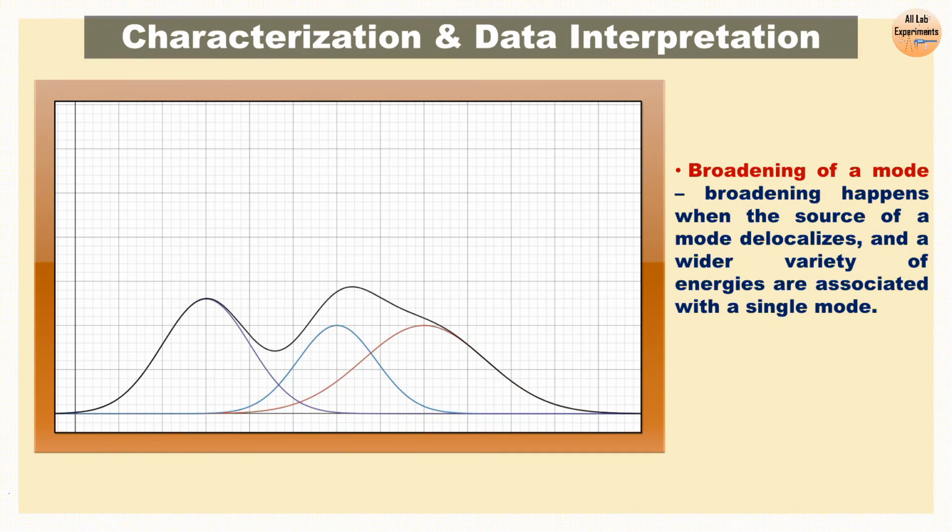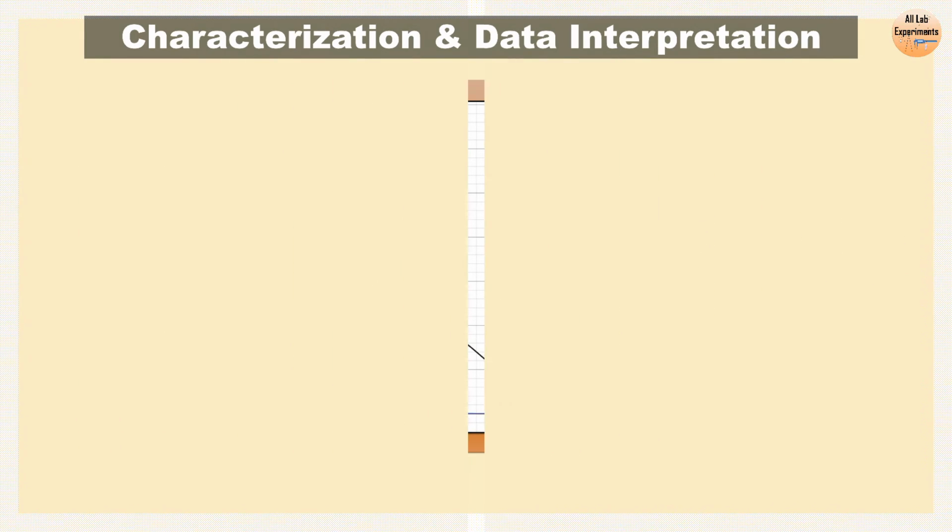Similarly, you can go through the literature related to your material and you could find several connected reasons which are causing the same kind of effect. But you can pick the idea that maybe in your material there are more impurities, that's why this is happening. You have added something, or that doping has crossed a certain level, after that this effect is happening. So there could be many explanations to it, but in a broad way I have explained this to you. Also, you can add this to your knowledge.